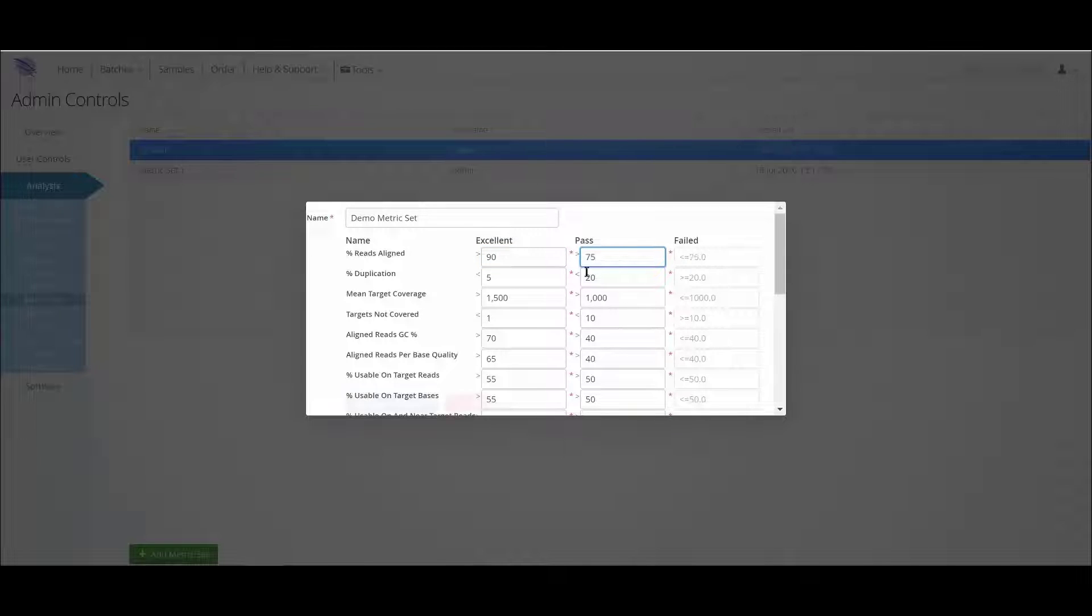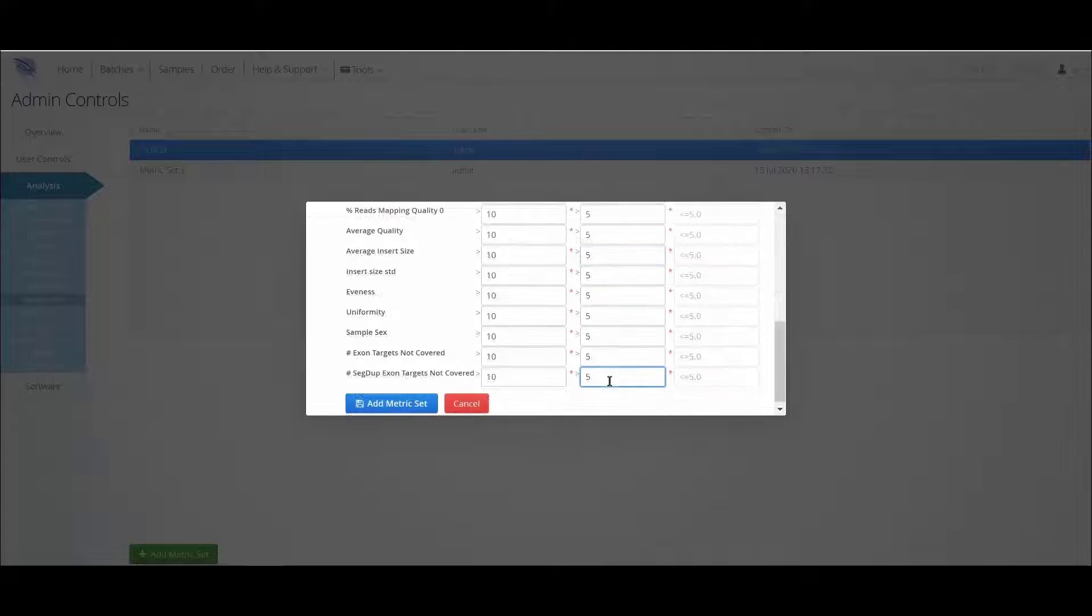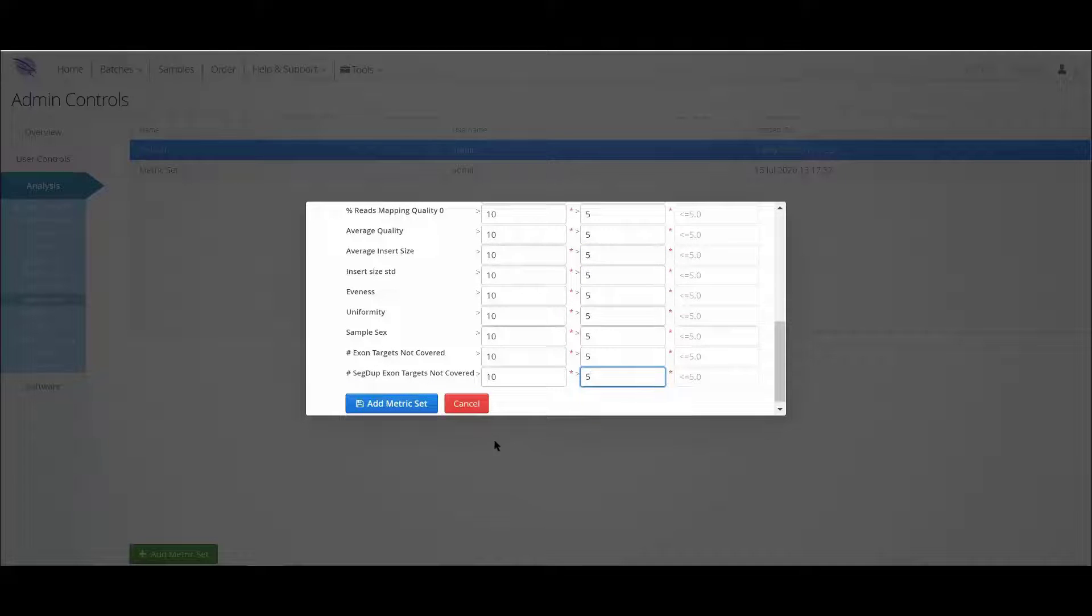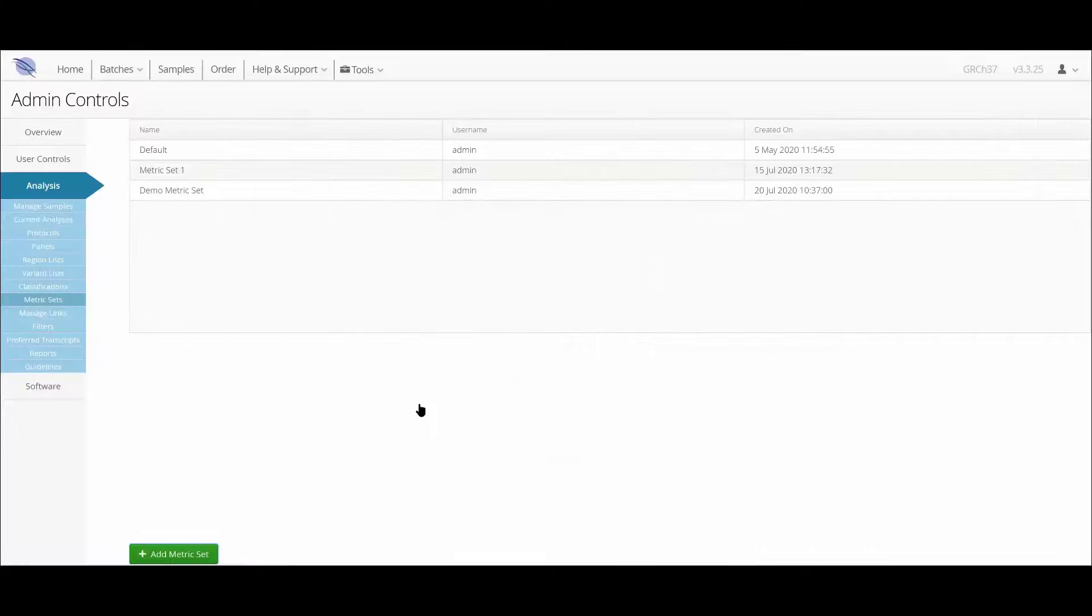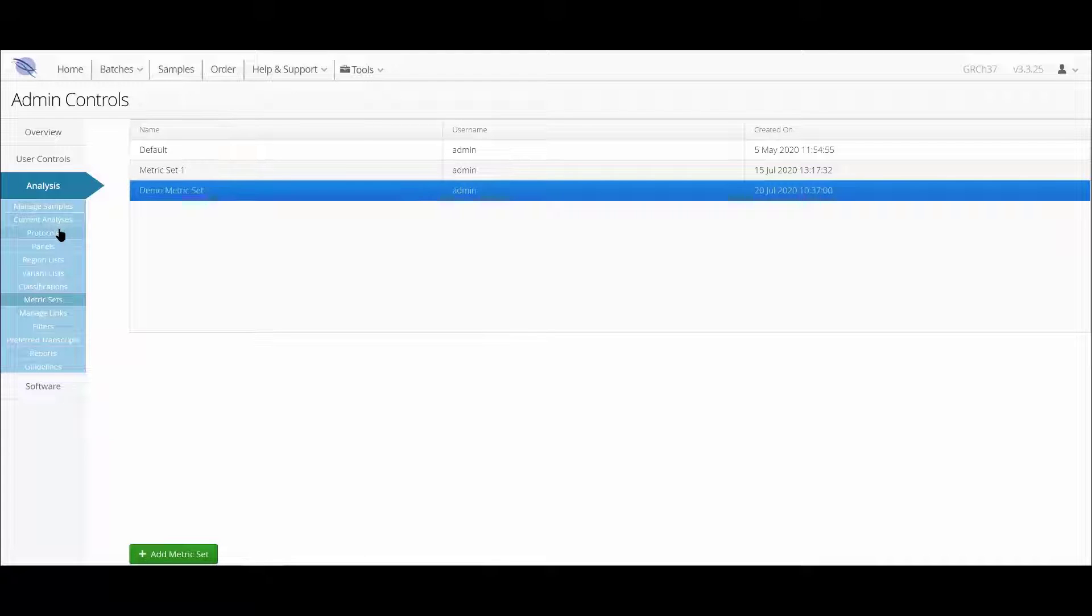The new metric set is saved by clicking the blue button at the bottom of the highlighted window. And once saved, this metric set is available to be added to a new analysis protocol.